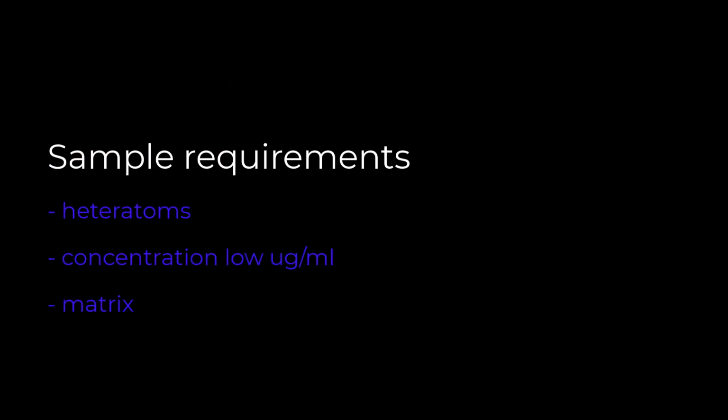Both ESI and APCI are capable of ionizing compounds that contain heteroatoms, but APCI can ionize molecules over a broader polarity range. ESI and APCI can generate gas phase ions from polar compounds. In general, compounds must contain heteroatoms to be ionized and thus be detected by the mass spectrometer.